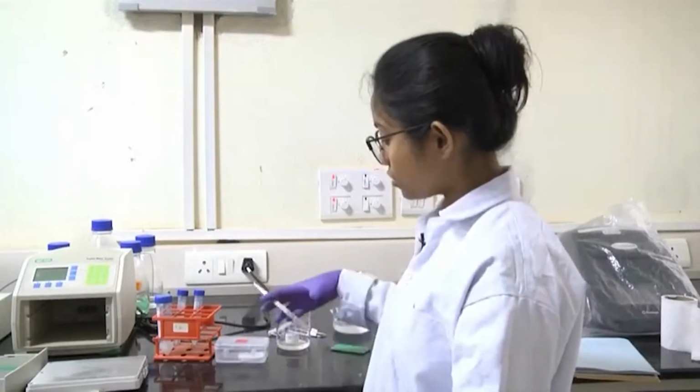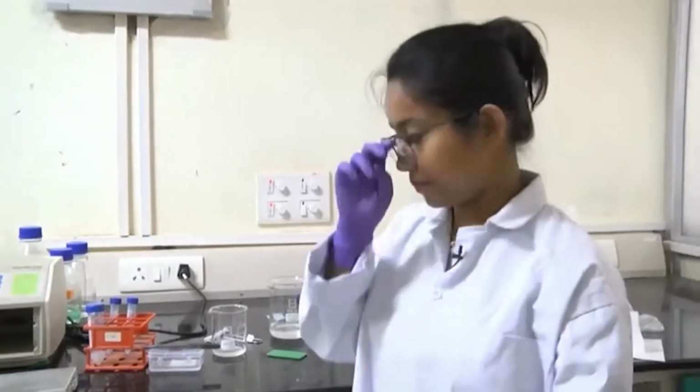Now, there are a few things during this Western blotting technique which we should remember. First you have to run the gel properly, so that all the proteins are separated based on their size. You can run either a native PAGE or a denaturing gel. If you are running native PAGE, you will not be able to get the molecular weight of the protein, but if you are running a denaturing gel, SDS-PAGE, then you will get the molecular weight as well. And after you run the gel, you cut a small piece where your protein is, and you place it on top of the membrane.